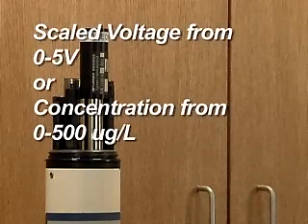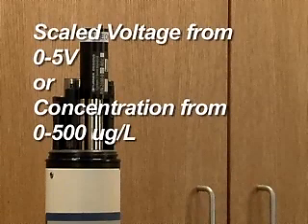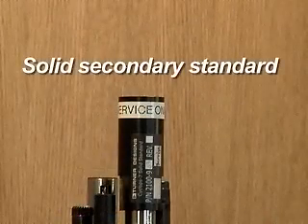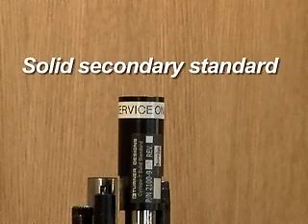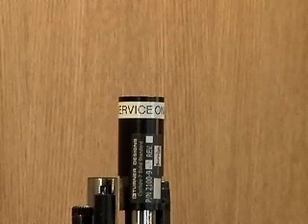The chlorophyll A fluorescence from the sample can be reported as a scaled voltage from 0 to 5 volts, or as a concentration from 0 to 500 micrograms per liter. The solid secondary standard for the fluorometers can be used to set a calibration point by comparing it to a known sample. It should be noted that a solid standard will give a unique response to each sensor — a given setting is only valid on the sensor it was calibrated on.